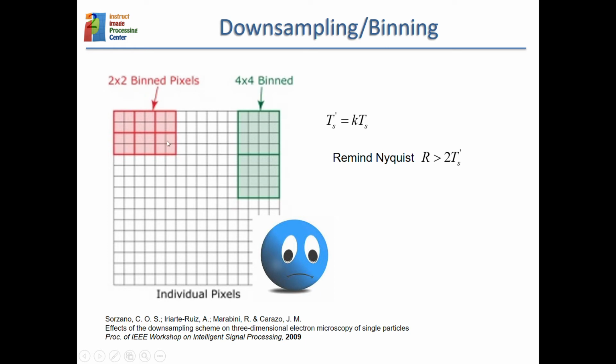So the binning is very simple. Let's say that I want to make the image twice smaller in each direction. You take big squares of size 2 times 2 and compute the average of the 4 values that you have in the original image, and now you have a single value, and you do the same for the next square and for the next square.